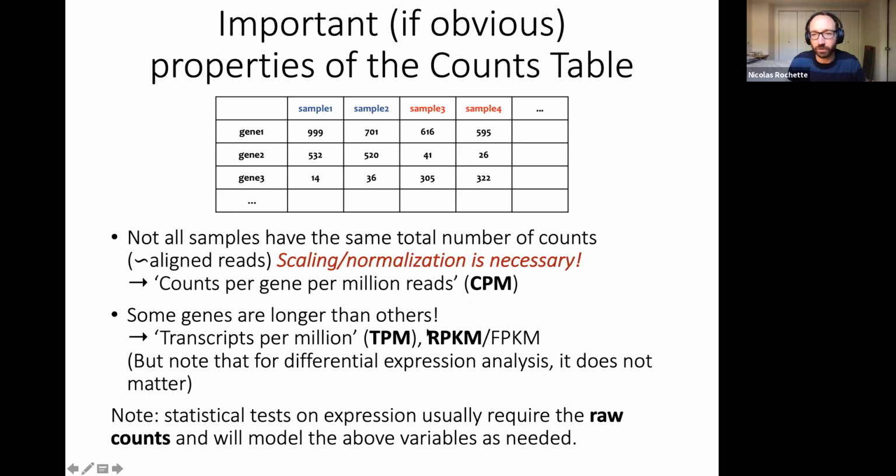Essentially, this is trying to say we have a cell and we're extracting RNA, and we're interested in knowing the proportion of the different RNA species in our transcriptome in terms of all of the transcripts present in the cell, and then trying to reconstruct the proportions. This is what TPM is trying to get to.